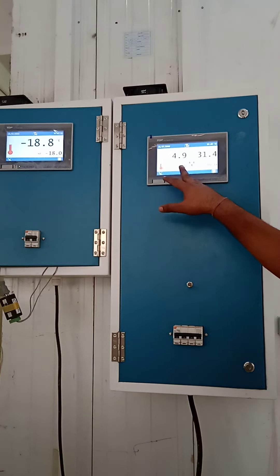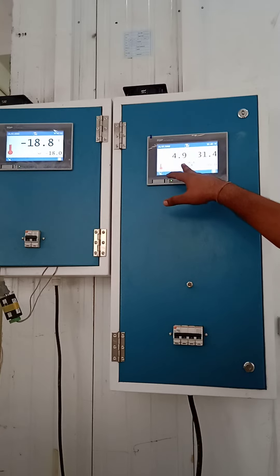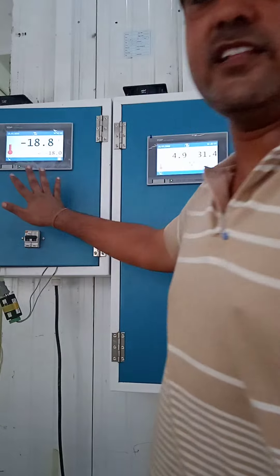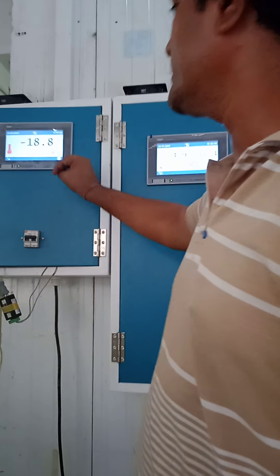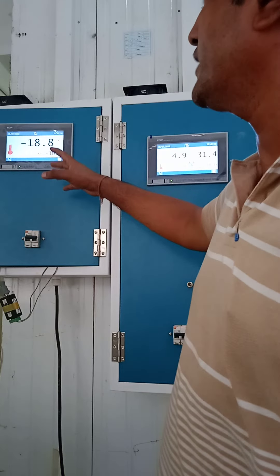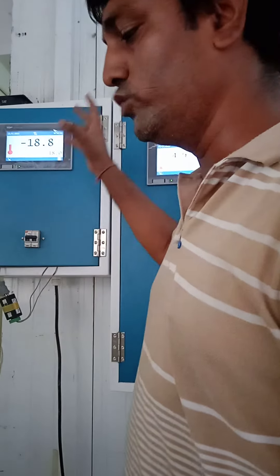If you see the accuracy, it becomes almost 0.1 degree. Here also the accuracy is very accurate, but this machine has just started now. That's why it is a little bit off — otherwise it is also making an accuracy of 0.2 degree.